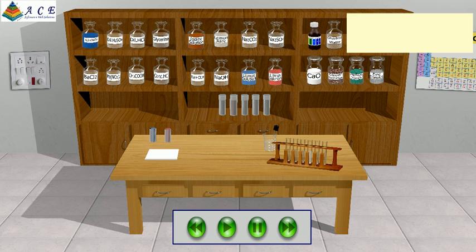We'll start with a pH test using blue and red litmus papers. Place the blue litmus paper on a white glazed tile, then place the red litmus paper on the same tile. Put two drops of dilute HCl from test tube A on both litmus papers.